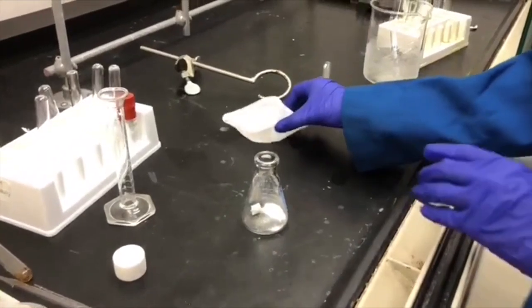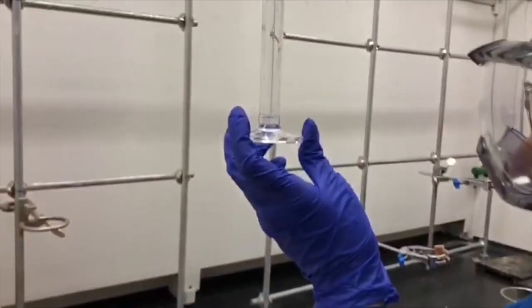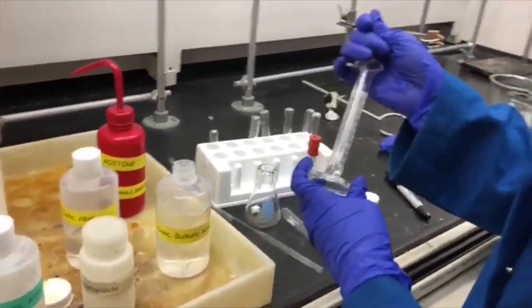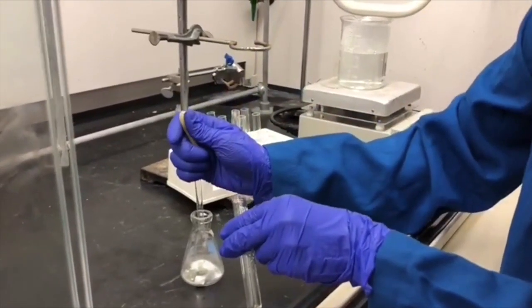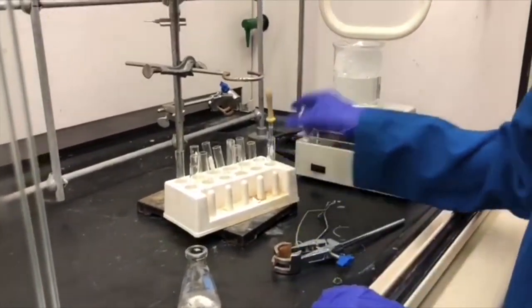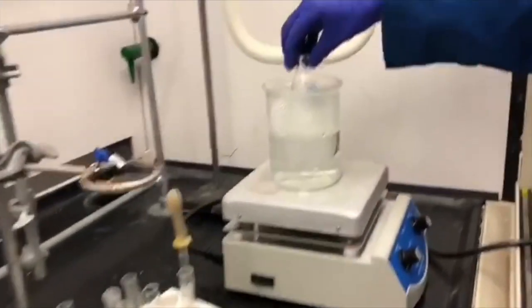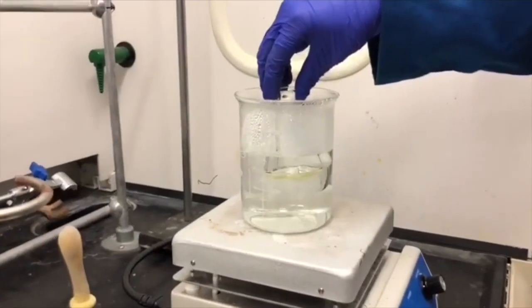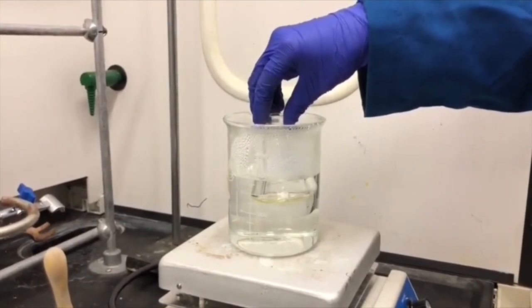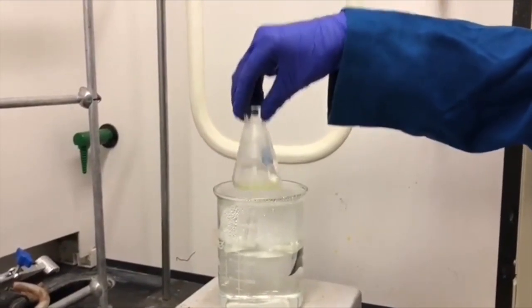because we're going to add 1 mL of concentrated sulfuric acid to it. So here I'm measuring out 1 mL of concentrated sulfuric acid, and here I'm adding it to the flask that had the acetanilide in it. And we've prepared a hot water bath so that the acetanilide will melt in the acid, and you can give it a whirl if it's not melting and keep repeating that until everything melts completely.